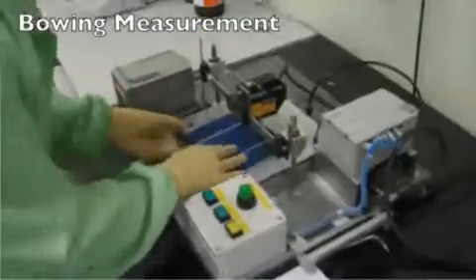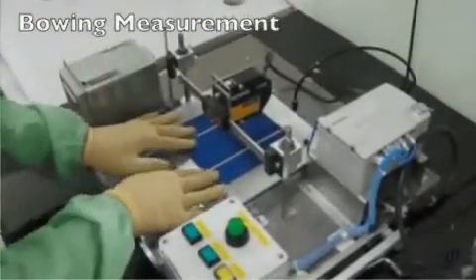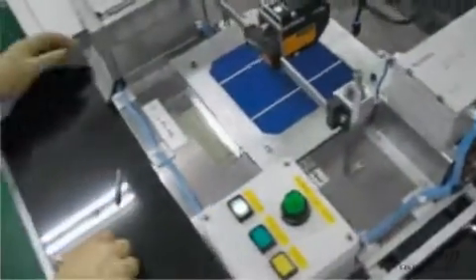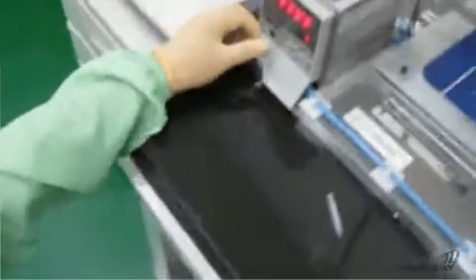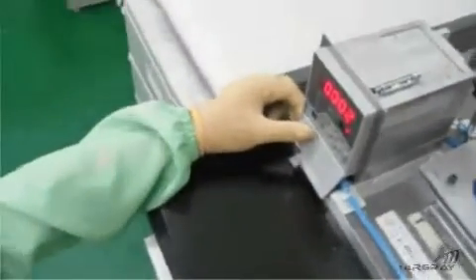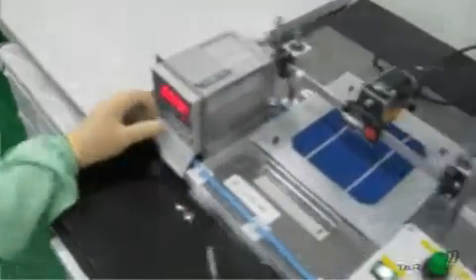In this test, we measure the bowing of the solar cell. No bowing would mean that the cell is completely flat. After covering the whole back surface of the cell with paste and firing it in the furnace, some stress is applied on the cell and a curvature is introduced. This bowing effect is undesired and must be kept to a minimum to avoid excessive cell breakage when the cells are manipulated to assemble solar modules.